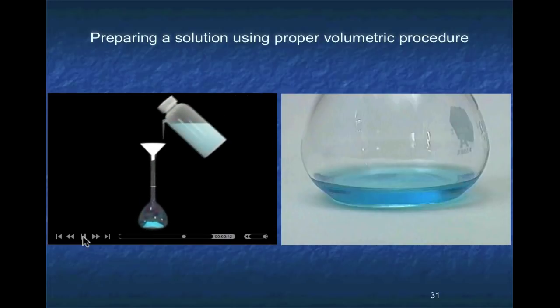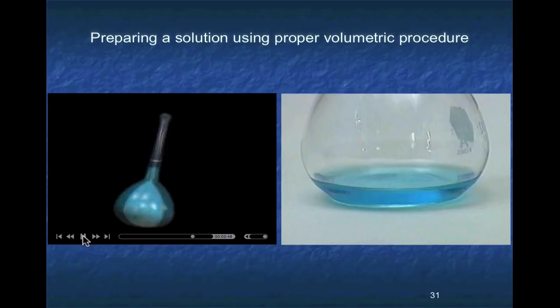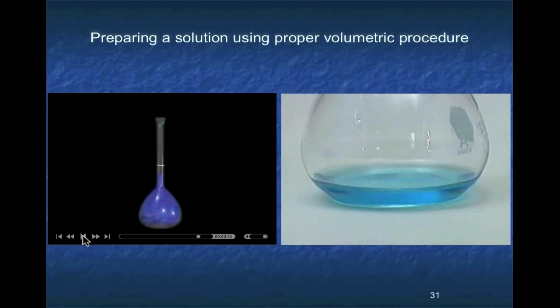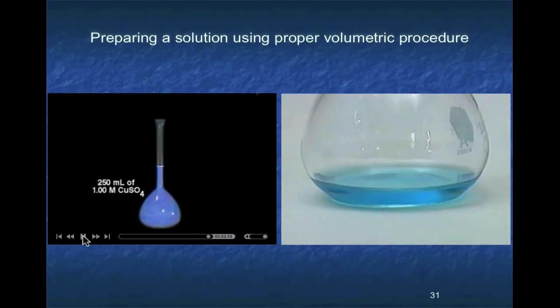Next, transfer the copper sulfate completely to a 250 milliliter volumetric flask. Water is added and the flask swirls to dissolve the solid. Finally, water is added to bring the total volume in the flask to exactly 250 milliliters.